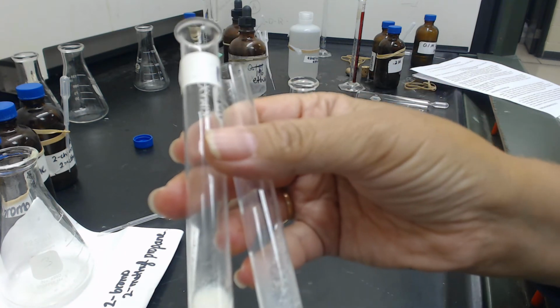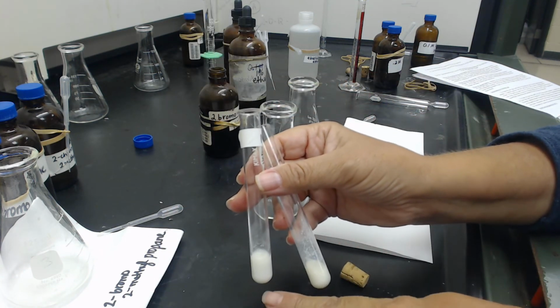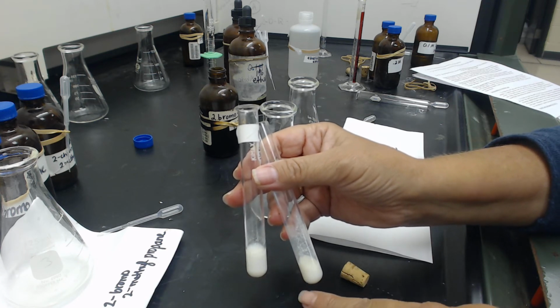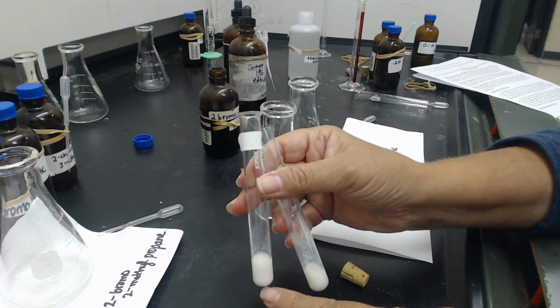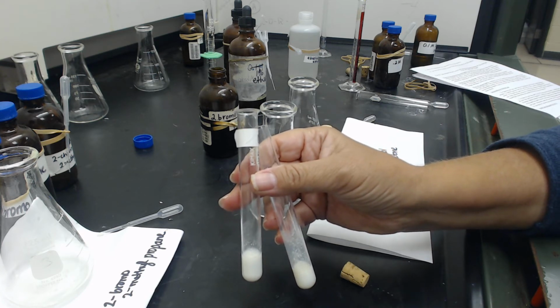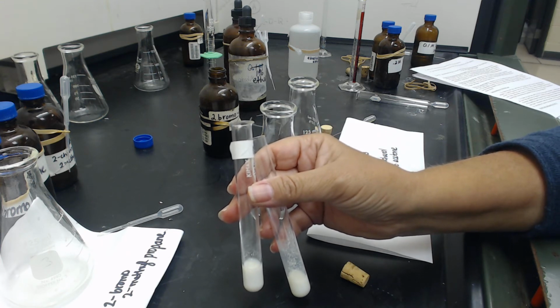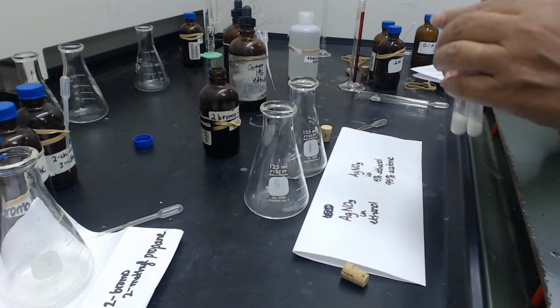Again, the one on the left, which is ethanol, they both turned pretty quickly, but the one on the left has much more precipitate and is much darker, and formed maybe just a slight hair quicker. Okay, so the ethanol went faster than the acetone.